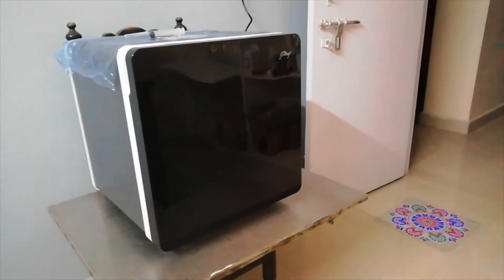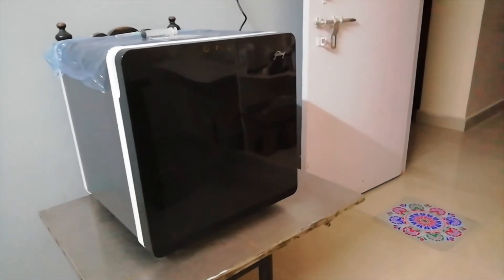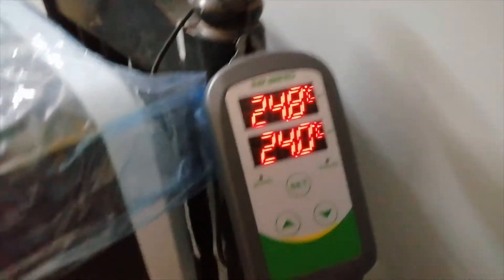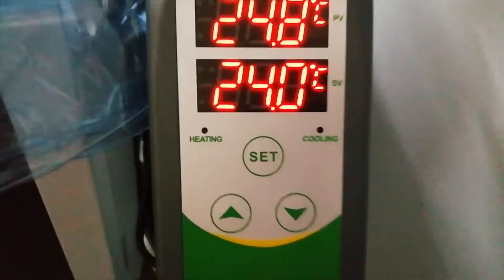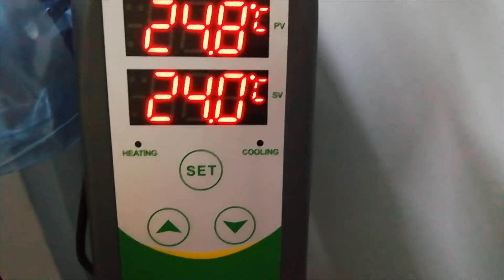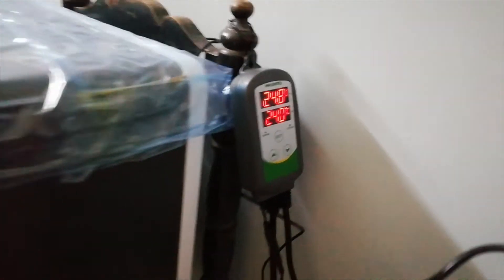Let's review how to set this up. All we need is one small refrigerator and a temperature controller. This is the Inkbird brand, which comes with heating and cooling options.